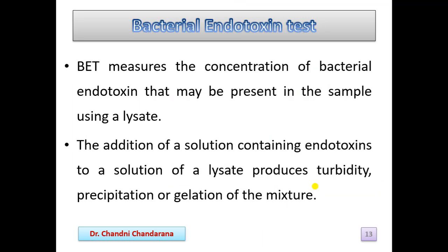Now the next test is the bacterial endotoxin test. It is a very important test. Bacterial endotoxin test, what is it? It measures the concentration of bacterial endotoxin that may be present in the sample using a lysate. The addition of a solution containing endotoxins to a solution of a lysate will produce turbidity, precipitation, or gelation of the mixture. That's why we have to use lysate.